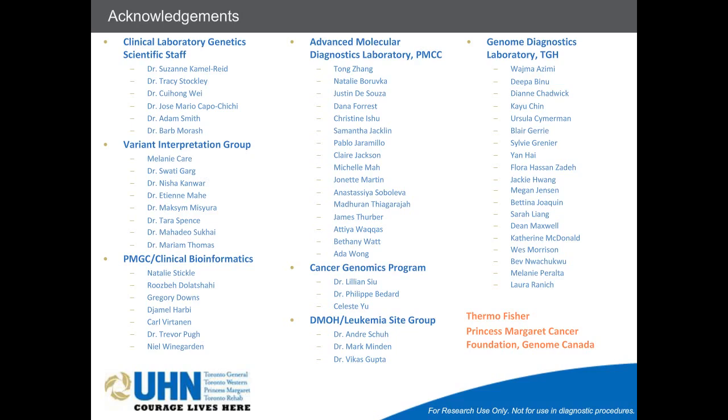Sure. Thanks, Marjorie. It was just one of the pre-designed assays from the vendor. So we used the Bio-Rad system, so it was one of the Bio-Rad digital PCR assays.